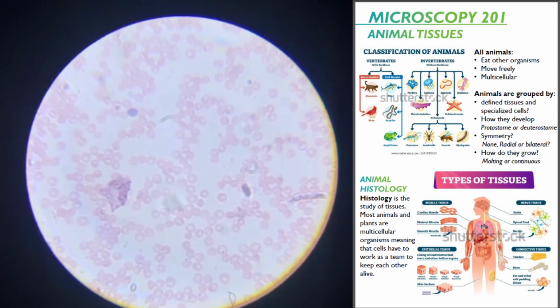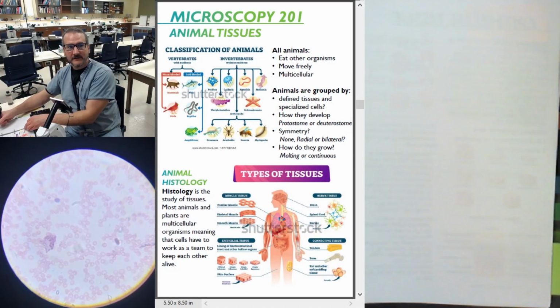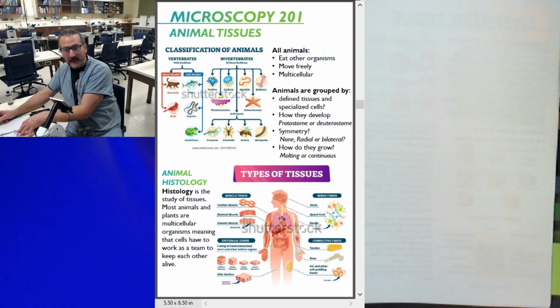It's really good sometimes to be able to jot down things like that, right? So if I were making a little note, I'd say, here's blood at my magnification, which was, I have the 40 lens times the 10 ocular, 400x total magnification.